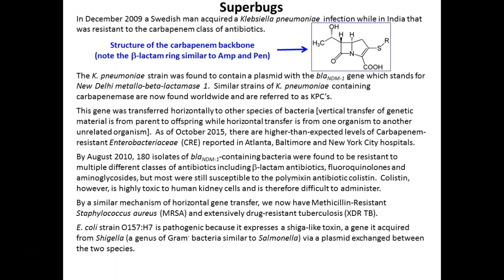So transformation can be used for lots of things. When I was in research, E. coli were really cheap machines. They copy DNA really well. And so scientists like myself would use them to make copies of DNA. We would transform them, give them DNA and get them to copy it for us. And then we would just lyse the cells and take the DNA from them that they copied for us.